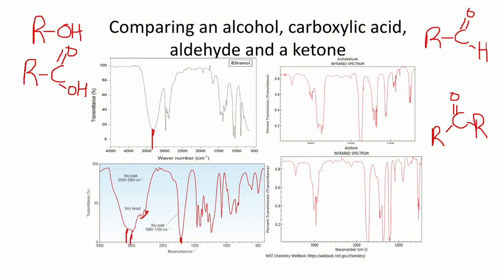It is important to note that the carbon to oxygen double bond within your aldehydes occurs at a higher frequency or more intensity than the one in your ketones.